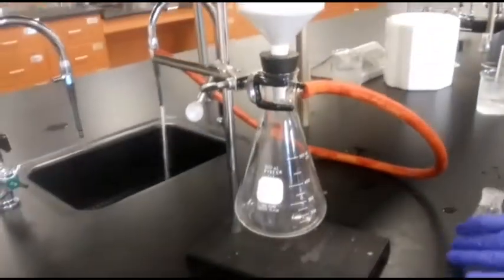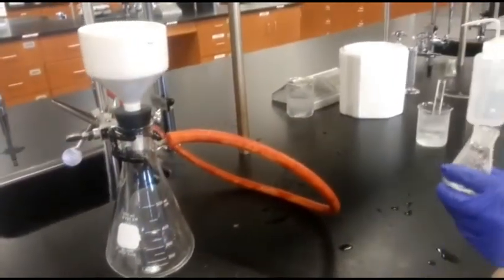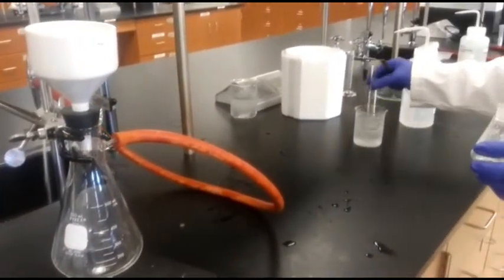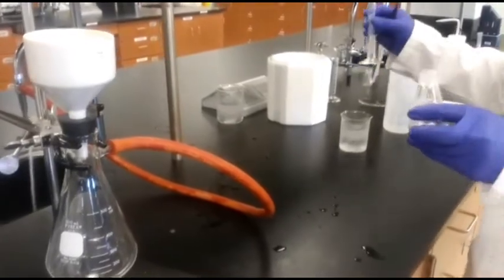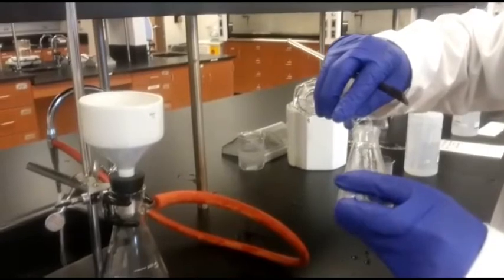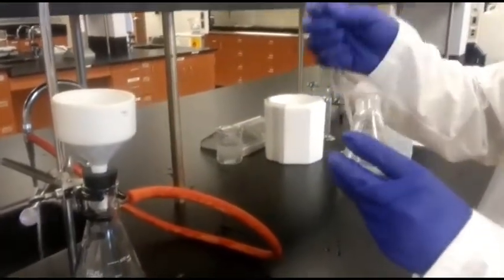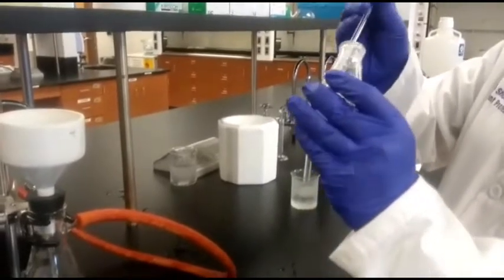And I have some product left in this Erlenmeyer flask, so in order to get that out, I will use a little bit of this ice cold water, so that I can rinse out all the product that is left here.